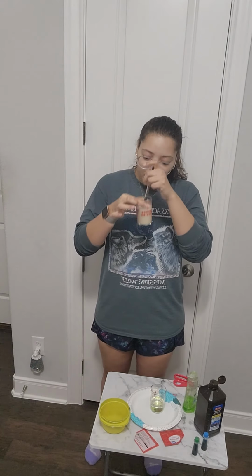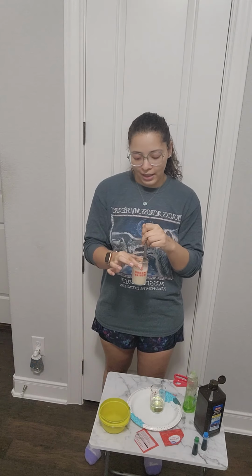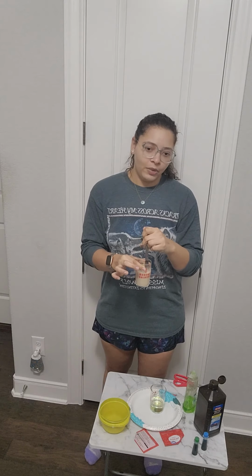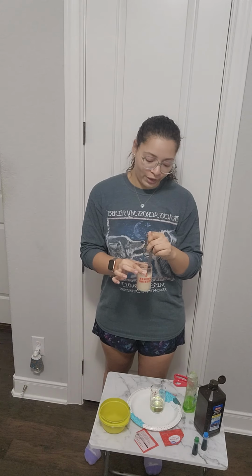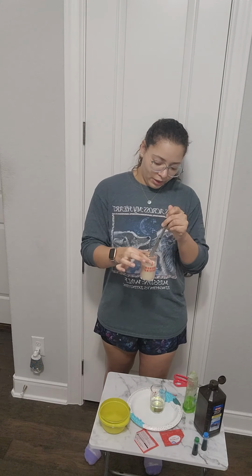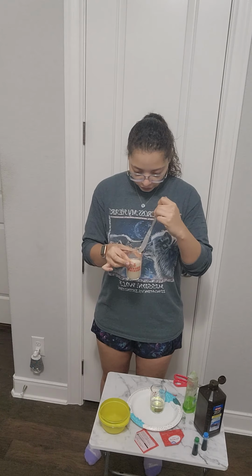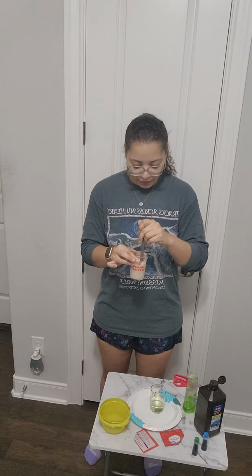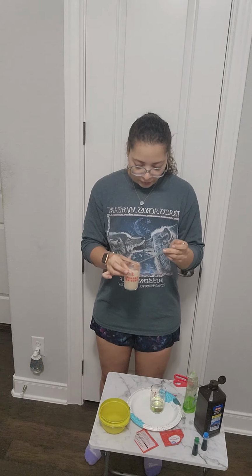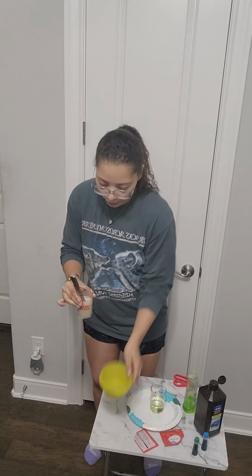What the dry yeast has in it is an enzyme known as catalase, which is our catalyst for this reaction. Just a fun side fact while I'm mixing here. I feel like I should add a little more water.